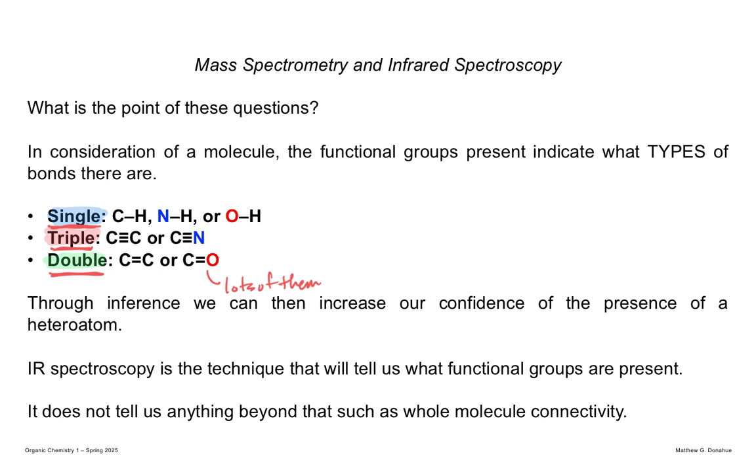And so it's like a matching game. You know, when you're a kid, you're sort of matching the shape to a name. That's really what we're doing here. So when we read this spectrum left to right, we're looking at those three regions. Is a signal there? If it is, what functional group does it look like? If it's not there, then you can eliminate it from being a possibility within the molecular formula.